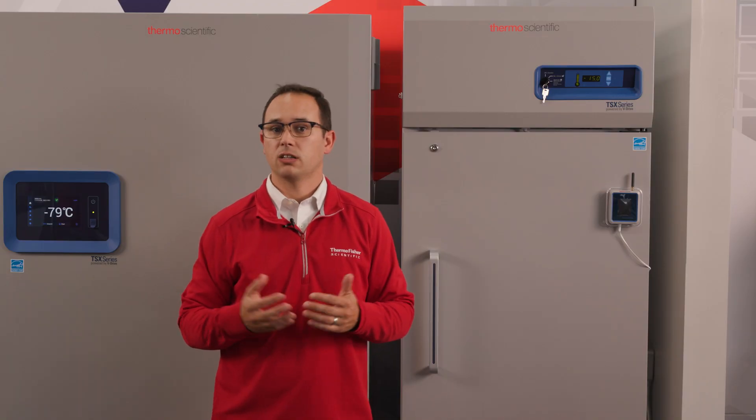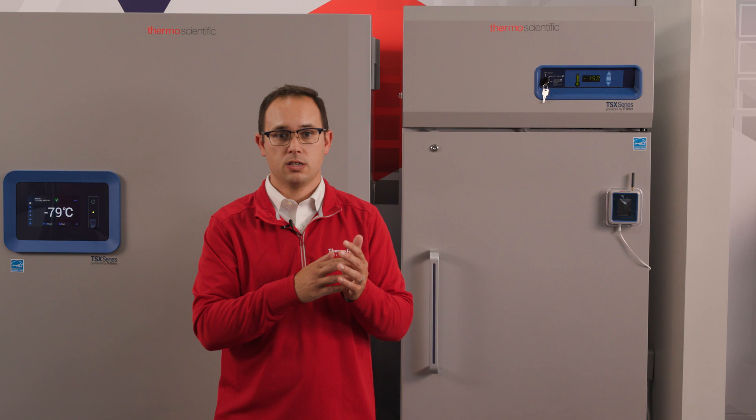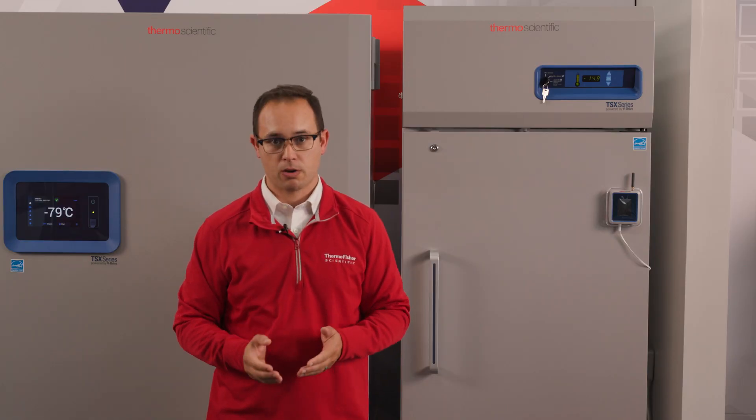The coils in this case look a lot like a radiator in a car and function the same way. There are hundreds of tiny fins in a grid that maximize the surface area between the refrigerant and the air pushing over it. The heater only heats up the evaporator coils, not the entire unit, so ice will only be removed from that housing. However, since this is the coldest spot and air is being pushed over these coils constantly, these coils are where a vast majority of ice buildup occurs. Like manual defrost freezers, ice needs to be removed, and in the case of auto defrost freezers, if that ice is not removed, it can have much more dramatic impact on the performance of the unit.